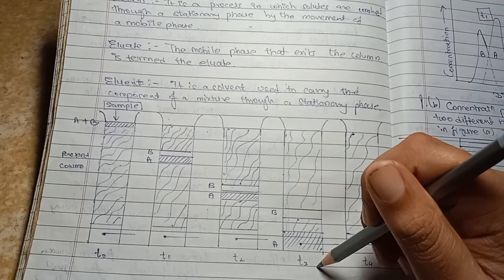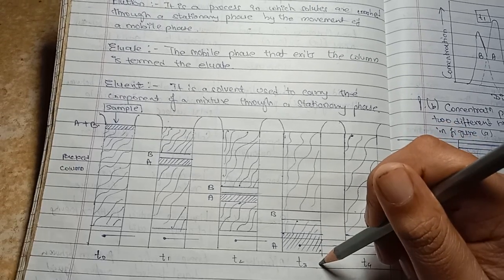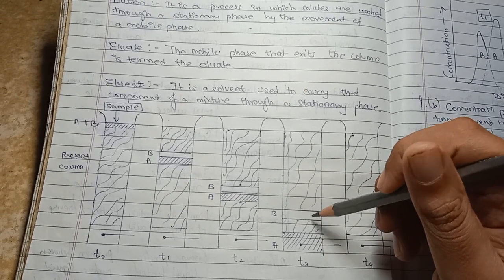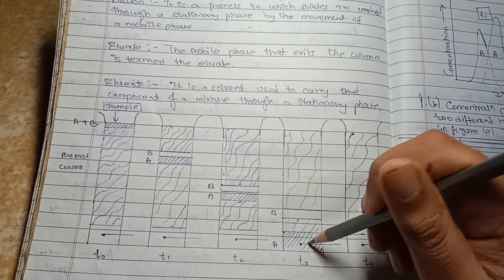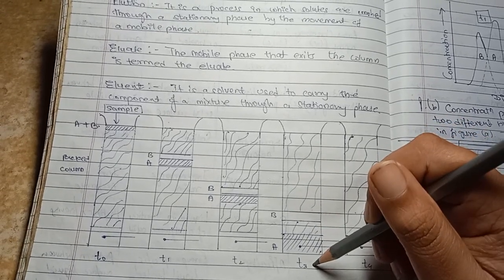Then later after some time, at time t3, component A will come out, and component B is separated very far from component A. That means A and B are completely separated at T3.